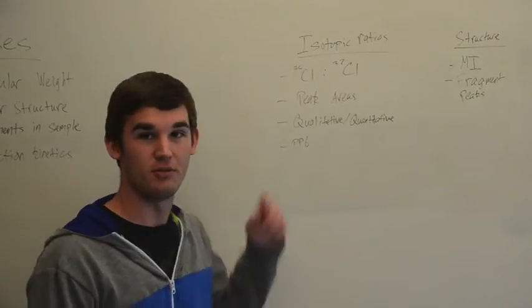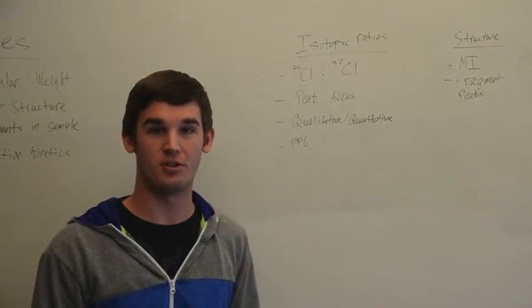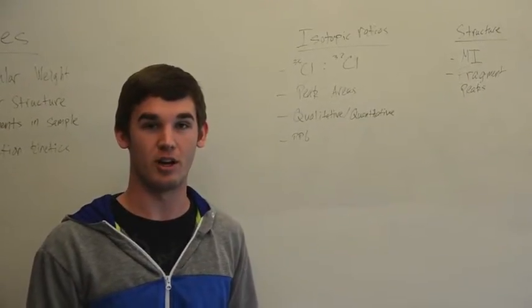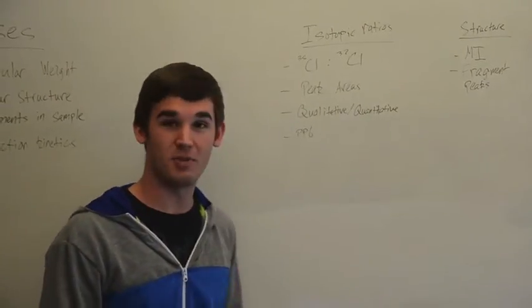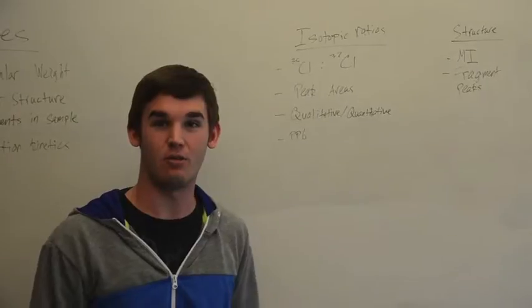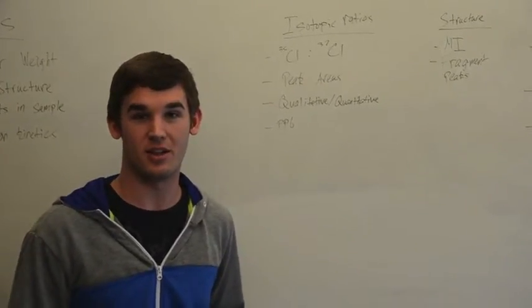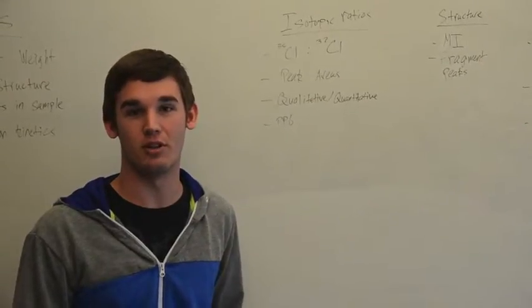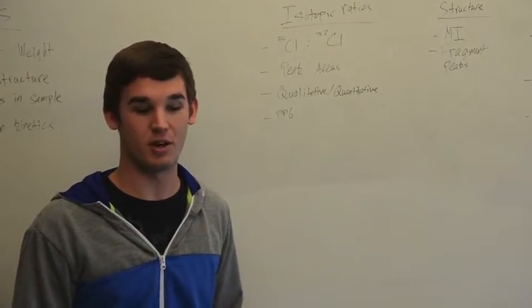The peak areas you find are also proportional to the amount of ions that have been detected, which is another way where you can determine what elements are present. This makes MS both good for qualitative and quantitative analysis. And the quantitative detection limit is in the parts per billion range, making trace analysis possible.